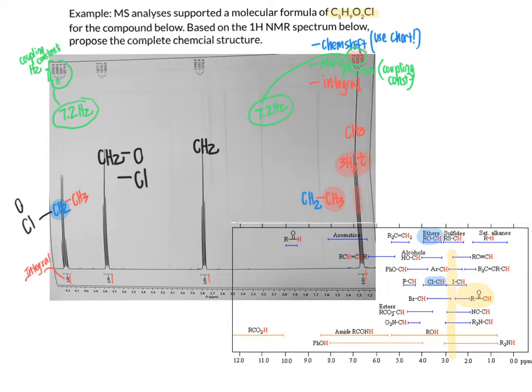We have an alkyne group, so we could think about that possibility. And then we have a sulfide, which is not going to work because we don't have that in the molecular formula. So this signal here that is between 2.7 and 2.8, we would conclude is perhaps a CH2 directly bonded to a carbonyl, or it's a CH2 that one might think of as being part of an alkyne group.